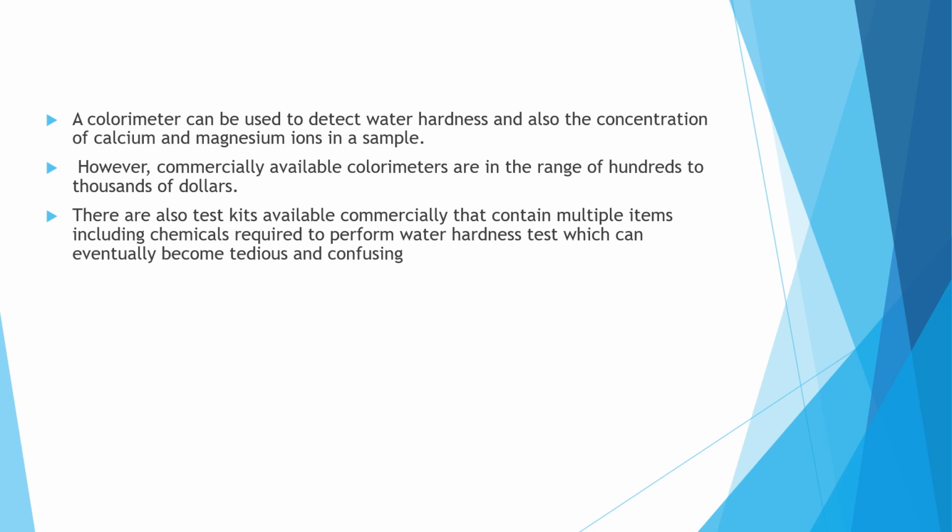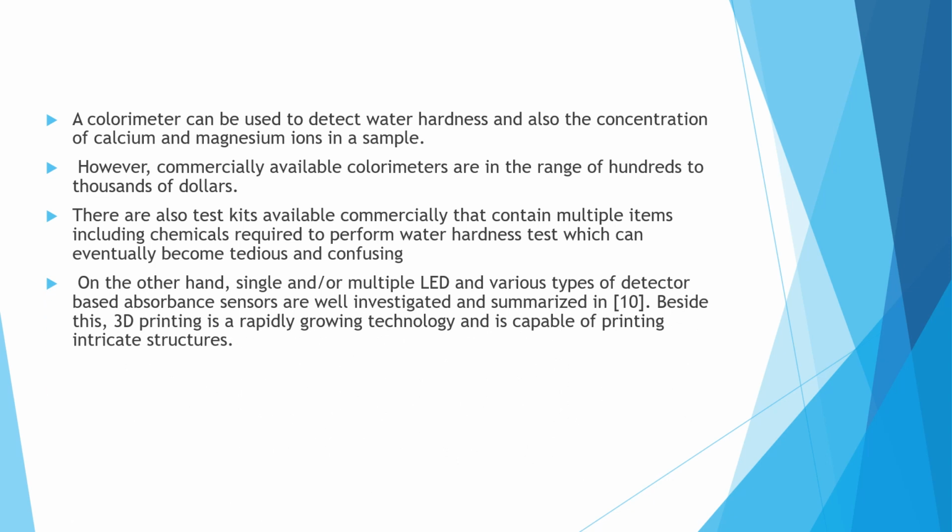There are also test kits available commercially that contain multiple items, including the chemicals required to perform a water hardness test, which can eventually become tedious and confusing. On the other hand, single or multi LED and various types of detectors based on absorbance sensors are well investigated and summarized.